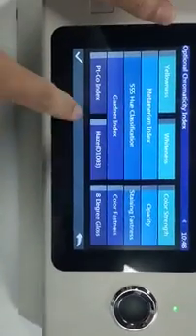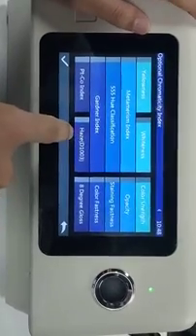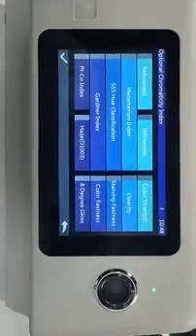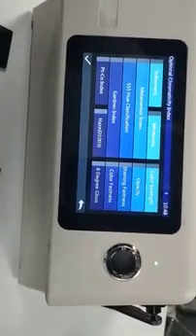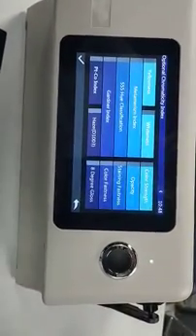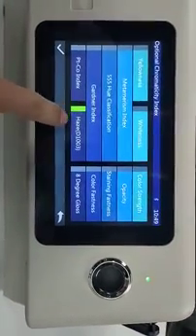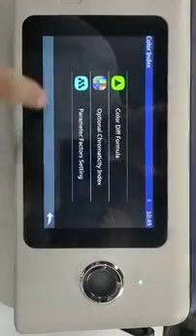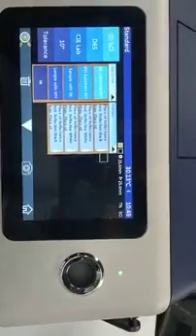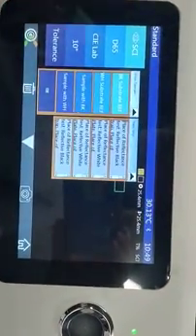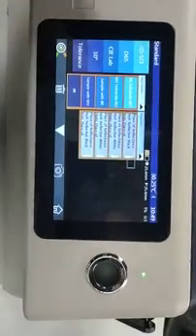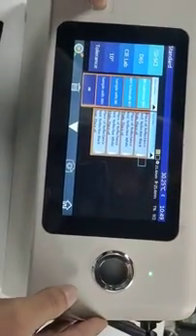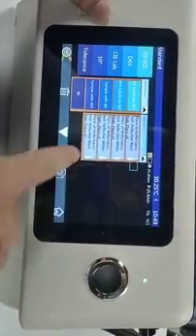Ok. This is the haze. To measure the haze. It's kind of complex. So I'm going to show you. We choose the haze. Confirm. Ok.